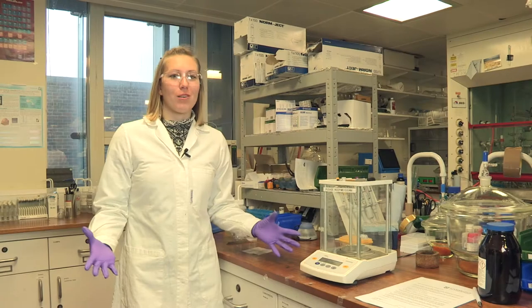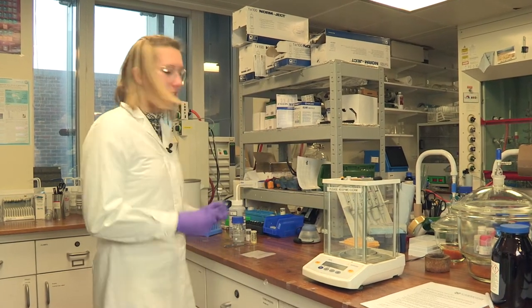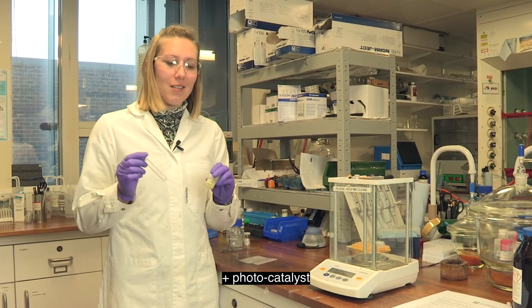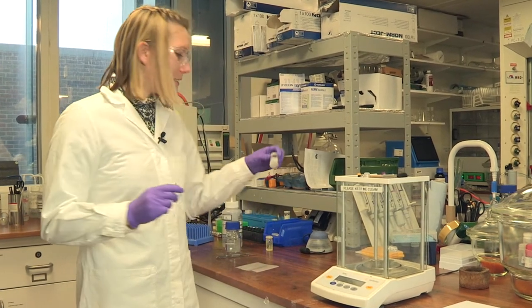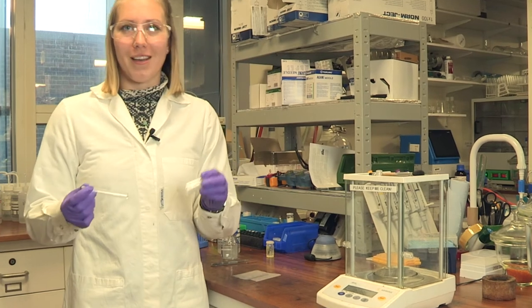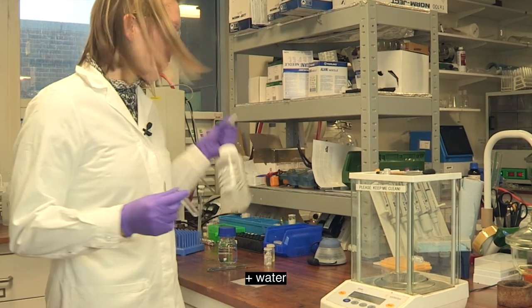Here I'm preparing one of my photoreforming samples. I'm going to take this vial, add my photocatalyst — which is the stuff that actually breaks down the plastic — then add my plastic. This is just little pieces of a plastic water bottle that I cut up. And then I just add some water. And that's about it.